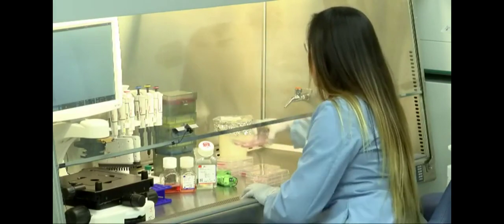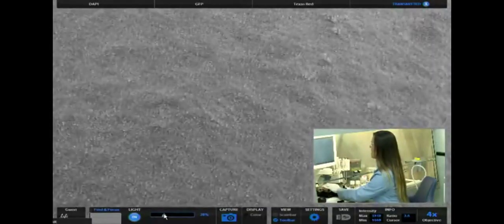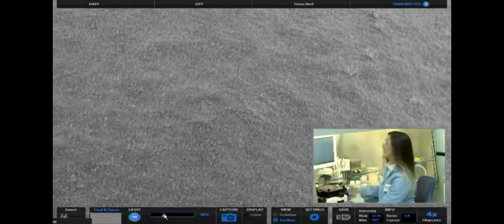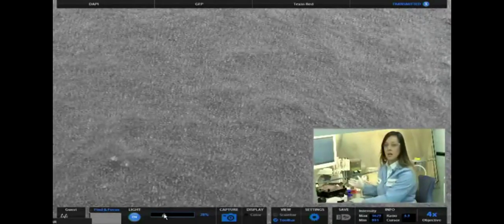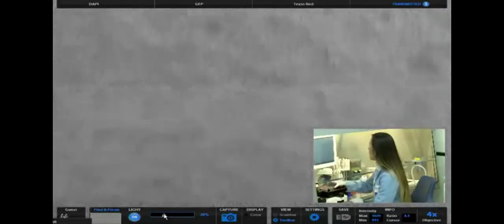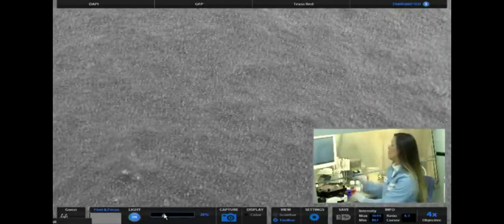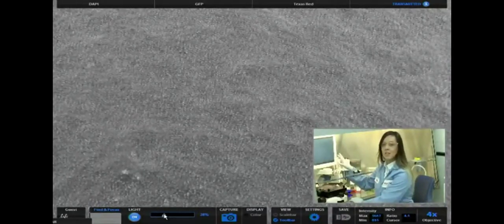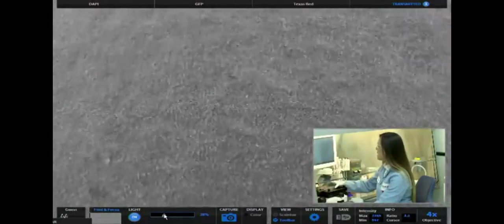And actually at day seven, you should have your full neural stem cell population. So I actually have an example right here for you guys. If we go back on the EVOs, you can see that these are day seven induced neural stem cells. So they're very, very concentrated and dense. This is a good sign because neural stem cells are quite small, so they'll kind of clump on top of each other too. You'll see like this mountainous structure. But what you don't want to see is more spread out, larger cell types in this. That could mean that you have some non-neuronal cells. But here, this looks like a pretty consistent, dense population, which is exactly what we want.